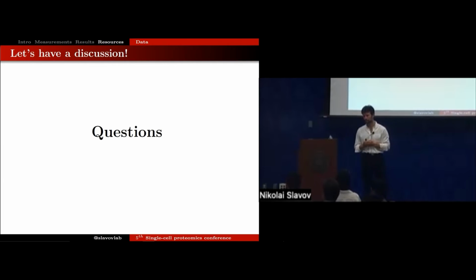Thank you for this presentation. I think it's a really good introduction to single-cell proteomics. I think I will start with a comment, and one thing we might forget about single-cell is the dynamic range of the proteome. If we talk about HeLa or if we talk about other cells, the dynamic range can be completely different, and I think that is something we are forgetting for now, because it's really a complex parameter to take in account.